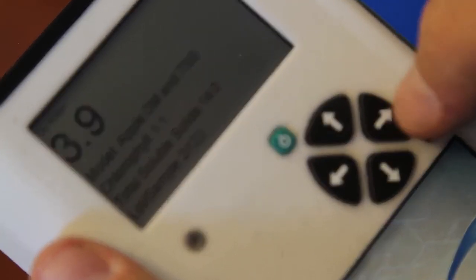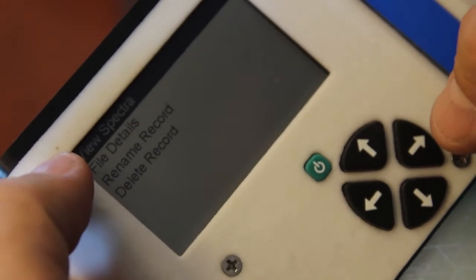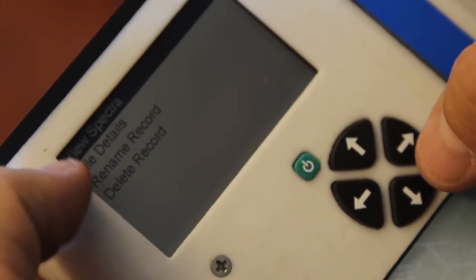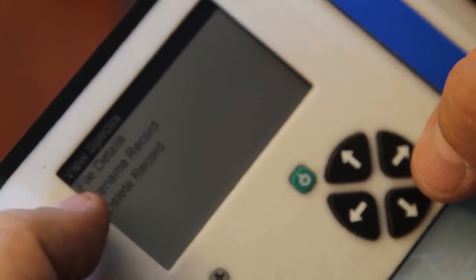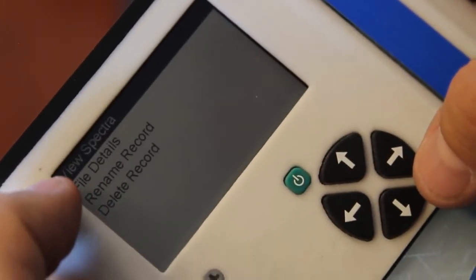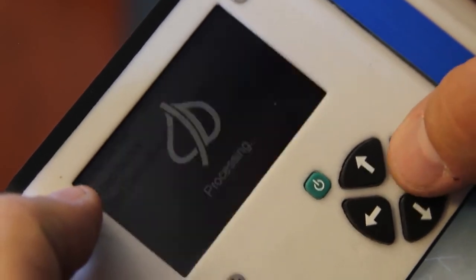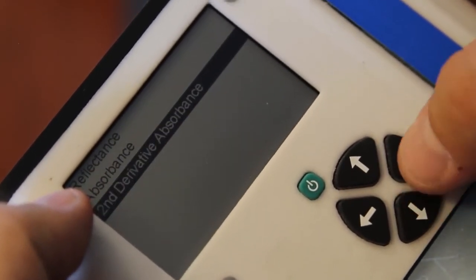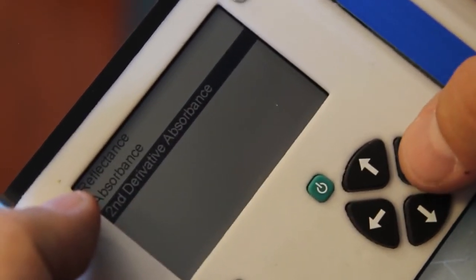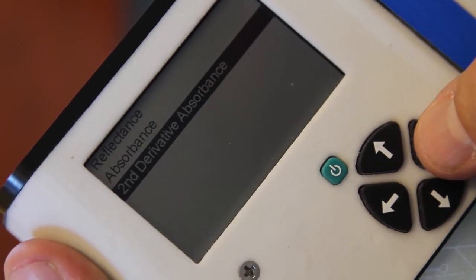Pressing the right arrow key allows us to view another menu with details about the measurement. The first option is view spectra. This would allow us to view the actual spectra that was recorded and used to calculate the data.